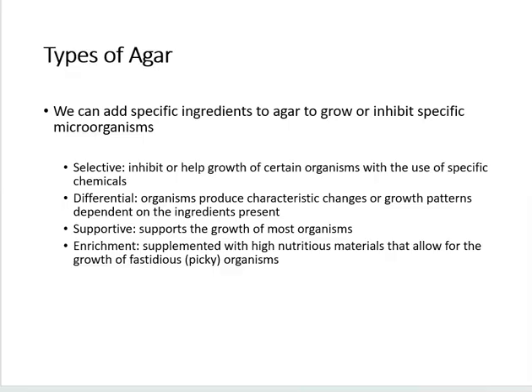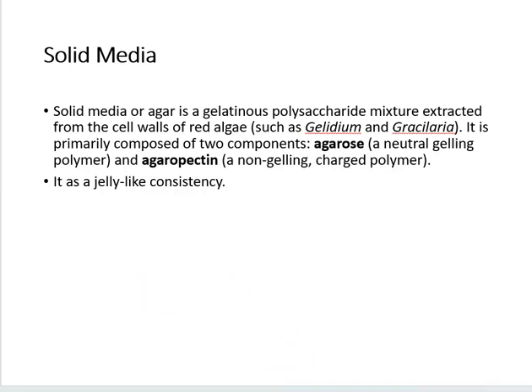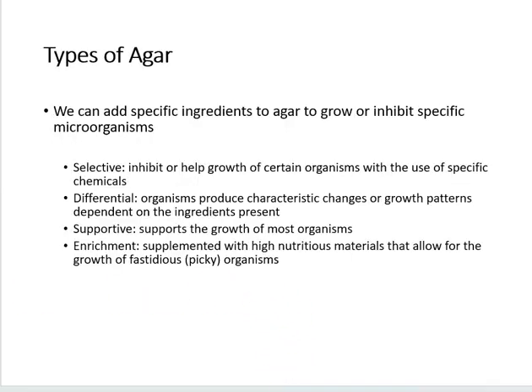But usually, we get a culture in from somewhere like a wound into the micro lab, and we generally plate it out on 5 or 6 plates because it helps us identify these organisms faster. If you just put it out on one plate, then everything grows, and if it's not all the same stuff, then you have to reculture it and reculture it to separate these organisms out. So generally what we do is plate it out on several different agars.